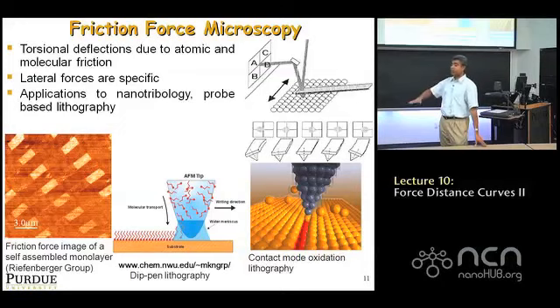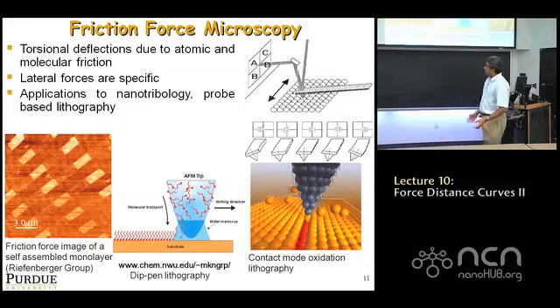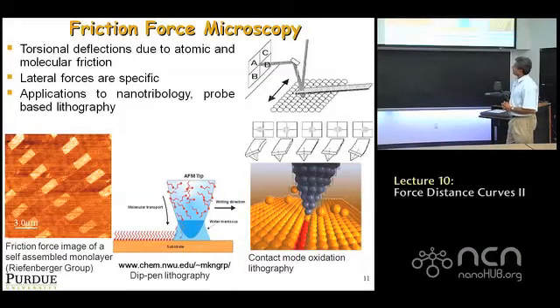So remember, what the photodiode measures is effectively the bending angle, the angle at the end of the tip, right? Because the location of the spot really changes due to a change in angle of the cantilever. In the same way, when it twists this way, it's the twisting angle that's measured in the photodiode signal. And using that, you can measure some very interesting properties.